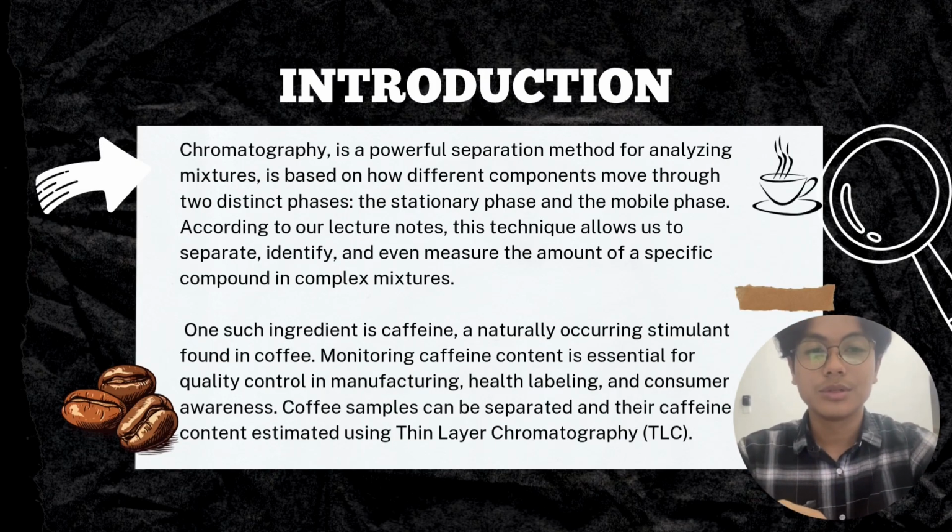Assalamualaikum. My group and I will present about quantification of caffeine in coffee using the thin layer chromatography method.